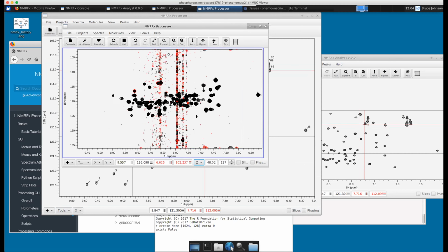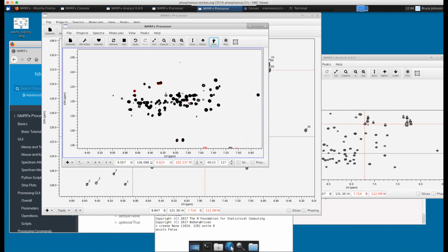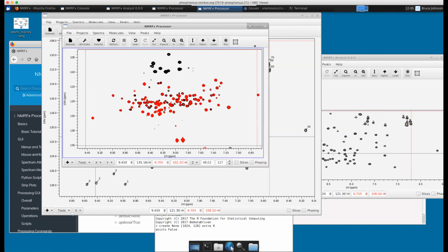Let's display full. Let's get the lower down. As it's drawing it, you can change any of these things. Any of the functions that change the view will interrupt the drawing, so that as it's redrawing, I can update the view. And basically, I just put the crosshairs.